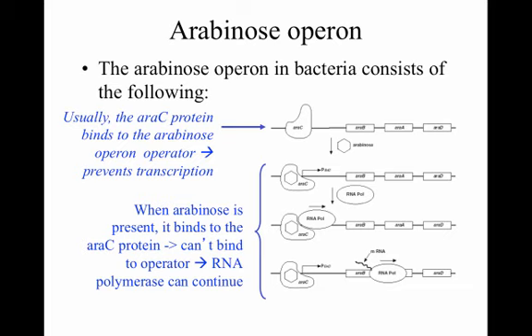Okay, all of this is only important because it gives you a context of what was naturally occurring in the bacteria. What scientists did for the pGLO plasmid was they took this operon and they adjusted it. And here's what they did. So if you look on the following page there, you have a diagram that says expression of green fluorescent proteins. We're going to look at that diagram now on the top of page 52.